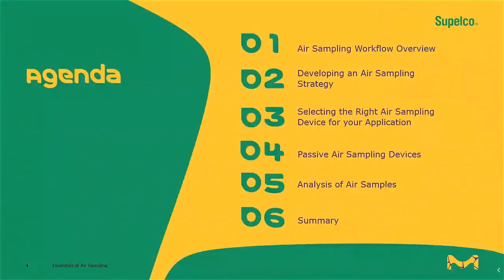Today's agenda includes an overview of the air sampling workflow, using the workflow to develop an air sampling strategy, how to select the right air sampling devices for your application, a discussion of passive air sampling devices, and analysis of air samples.